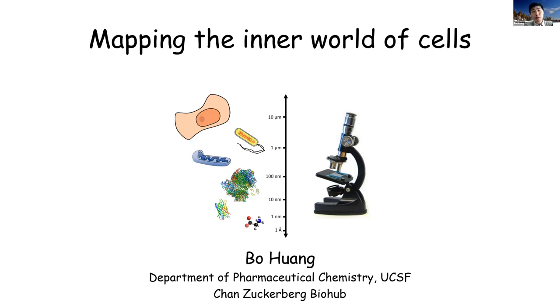Another thing that we've been looking at, and in fact, the postdoc just showed some really cool movies in a group meeting a couple of hours earlier than this, so I haven't had a chance to move those movies into this presentation. We have been looking at the overall morphology, and particularly many of these organelle markers during the cell cycle, particularly the entry and exit of mitosis. There are some really cool and surprising details that we can see from those movies.